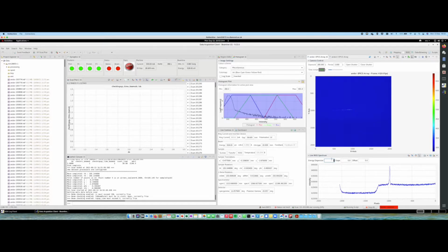These are not really proper values, but as an example, if we include the value of a dispersion and then click update, you see that it looks more sensible. We can do the same here, and then it gets close to the zero. You just need to tweak it using the right value so that it corresponds to the zero, and like this you can get a view of the data that you're measuring. Of course, this is a carbon tape signal, and using the carbon tape is much simpler to align the zero perfectly.